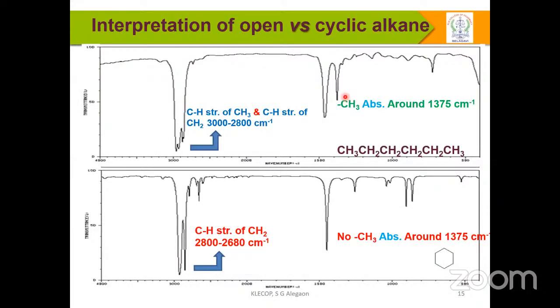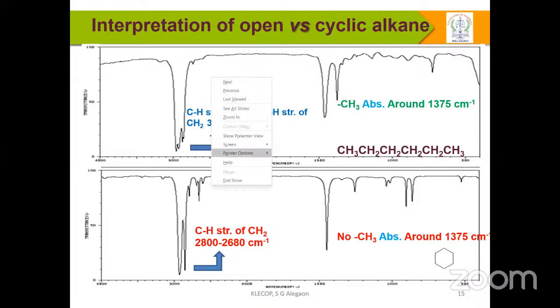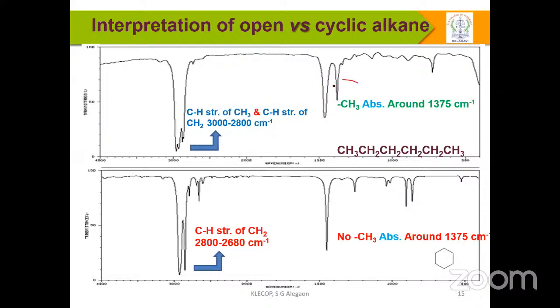Okay, here I am giving a comparison. Can you see here? You can see the CH3 absorption somewhere around 1375 reciprocal centimeter, and that peak is missing over here.